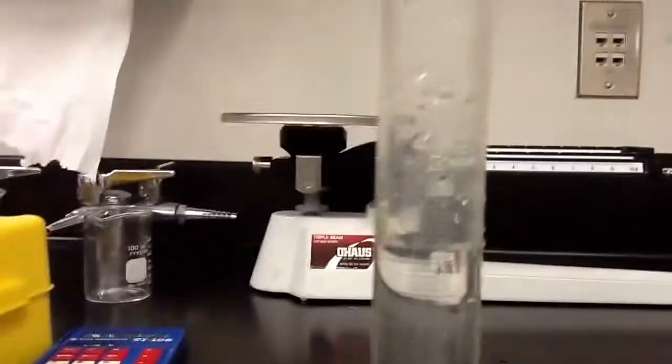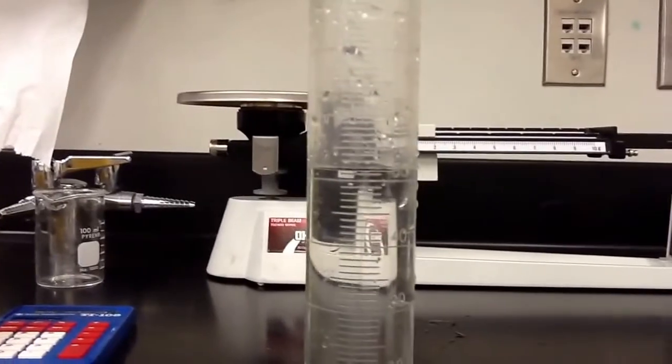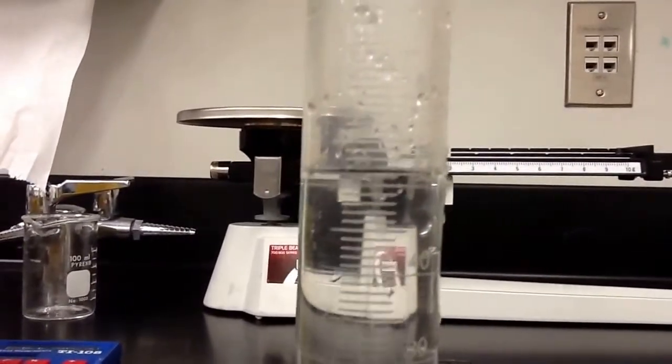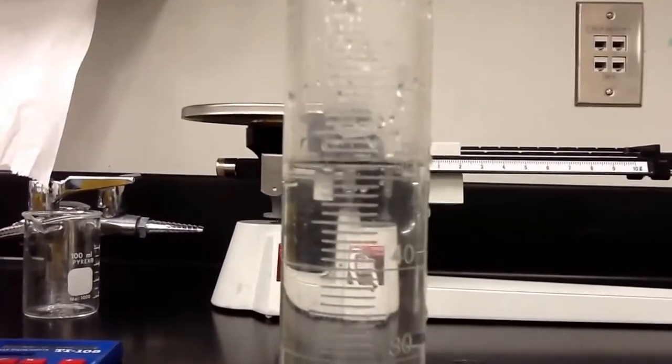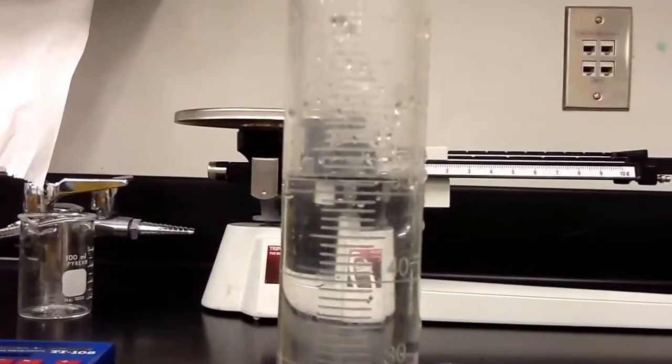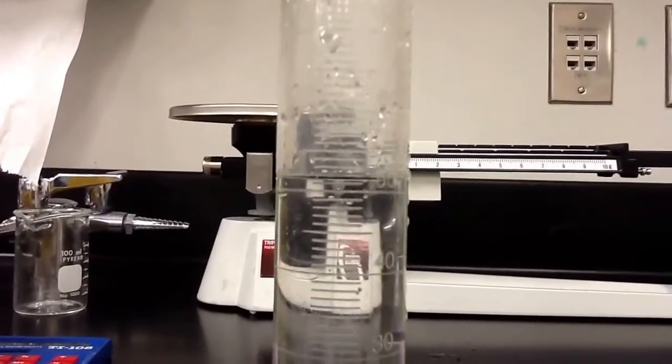You need to go down and look at it. See that little dark line at the top of the water? That's the bottom of the meniscus, and it's hitting the top of the 51 line. So that's why it's 51 milliliters.